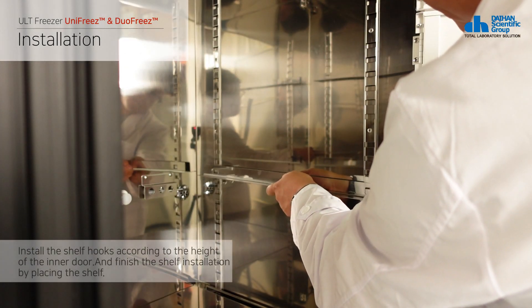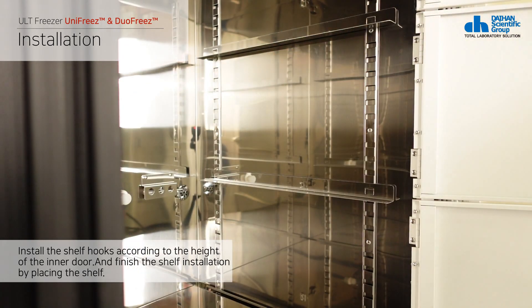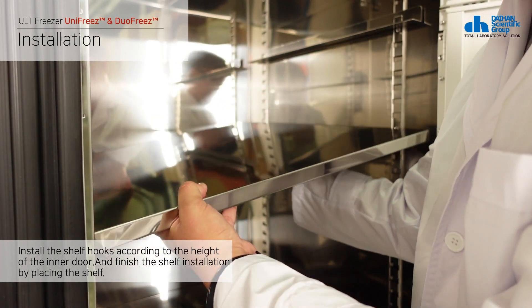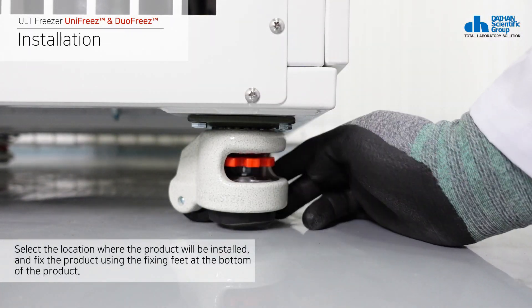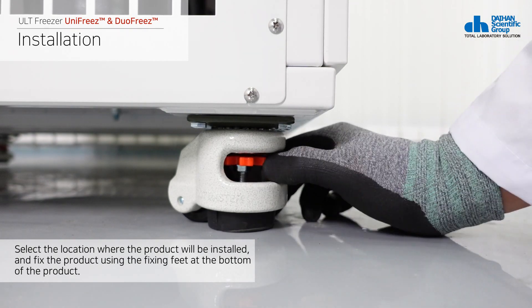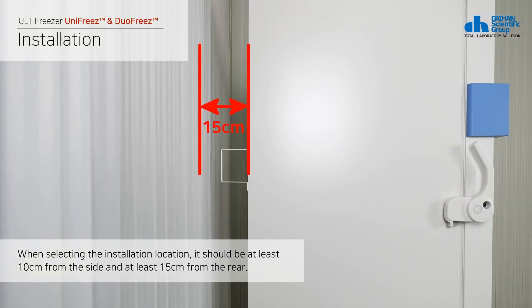Third, install the shelf hook according to the height of the inner door and install the shelf on the shelf hook. Fourth, select the location where the product will be installed and fix the product using the fixing feet at the bottom. It needs at least 10 cm from the left and right walls and at least 15 cm from the rear wall.